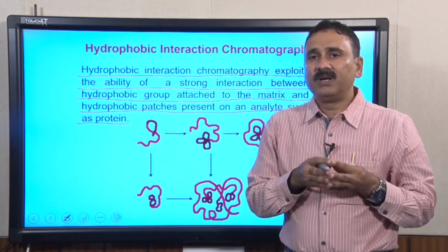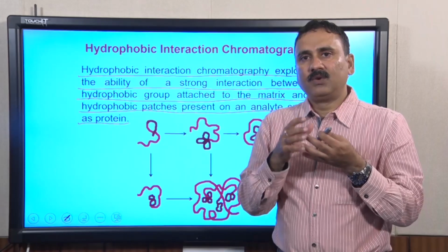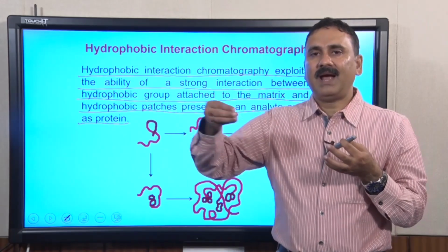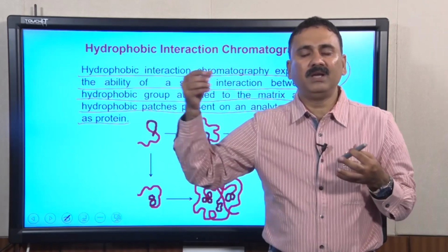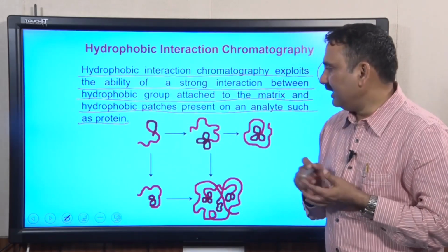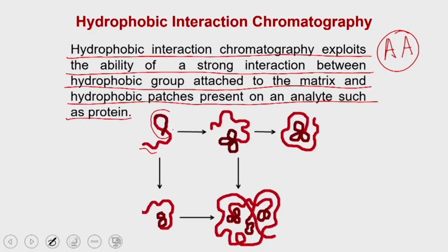But the hydrophobic amino acids do not like water, because they would like to shield from the water. So, while the protein is being synthesized as a chain of amino acids, it starts folding, and the folding is always guided by the sequence of amino acids. You can see that as the synthesis of a protein starts, this dark region is the region containing the hydrophobic amino acids such as tryptophan, phenylalanine and tyrosine.